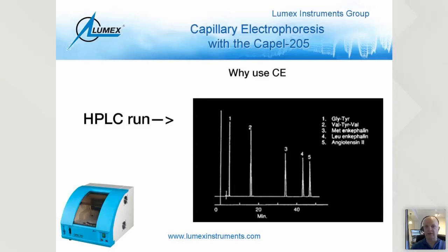I've actually worked 7 years in research doing these types of separations with an HPLC. And when CE first came up in our lab, we were playing around, testing several things, and we kind of had fun with it at the time. It's still a very awesome tool to have because there are a couple of things that do occur.